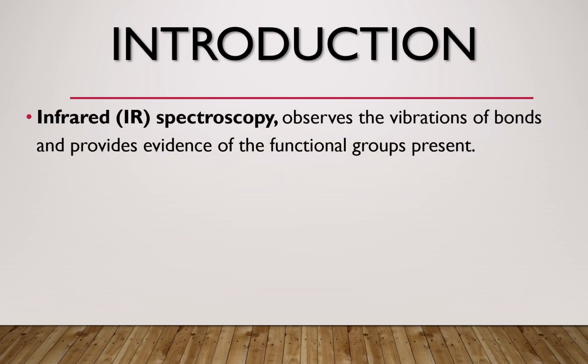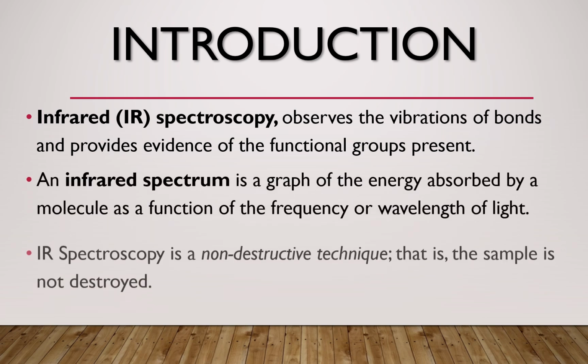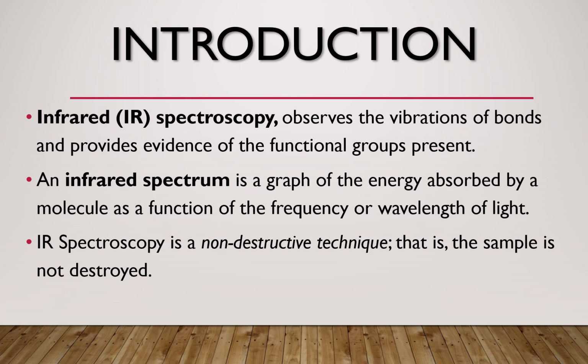So IR spectroscopy, as I explained in the previous video, observes vibration of bonds and provides evidence of functional groups present in the molecule. It is actually a non-destructive technique where the sample is not destroyed.